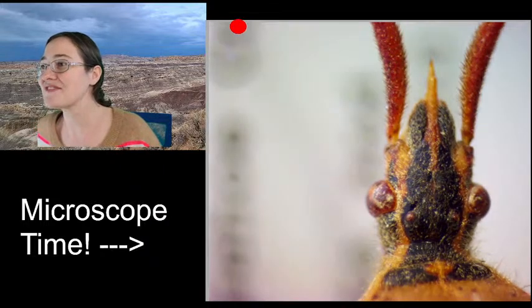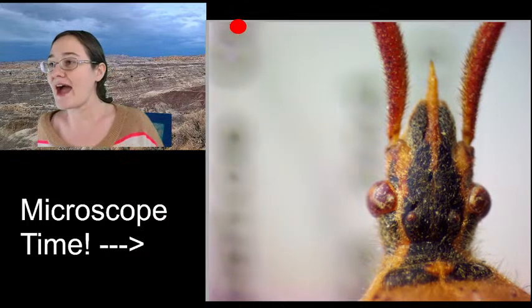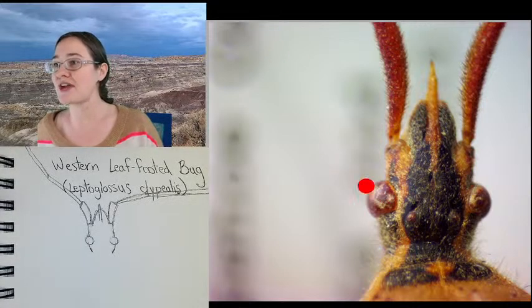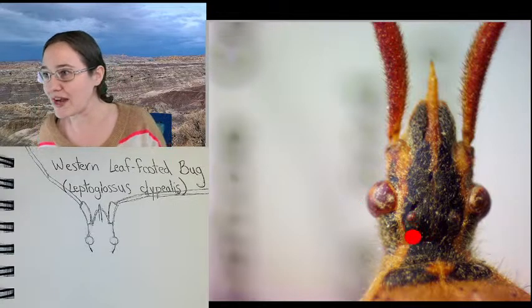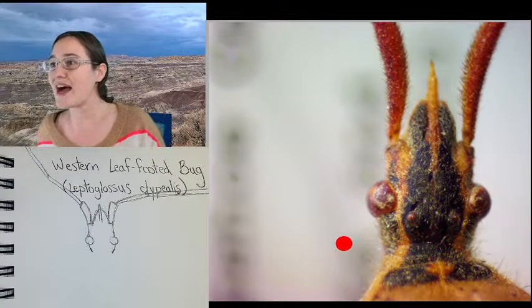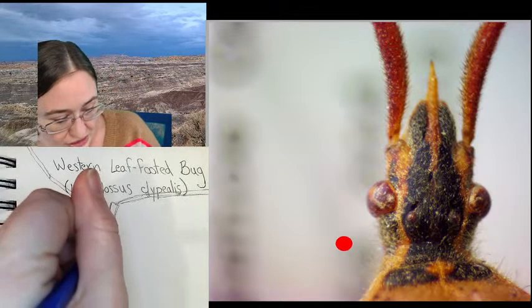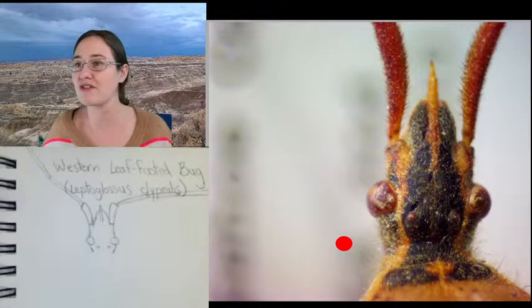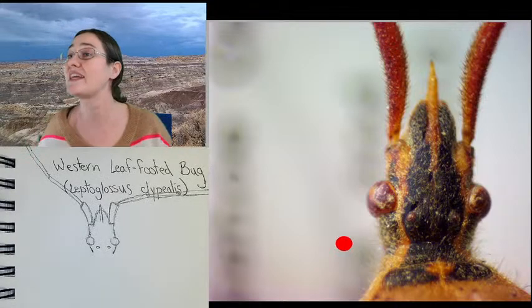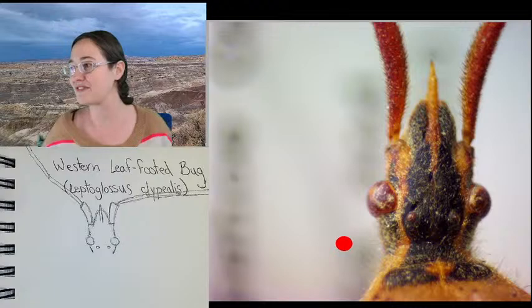All right, so we've got a variety of really awesome characters here to check out. He has these really awesome compound eyes here, right? And then if we look really, really closely, right about here and there, our specimen does have two little ocelli, or little itty-bitty simple eyes. These are those light sensing eyes that can't really see shapes and colors, but they can see light and dark. So they have the ability to kind of see shadows, see things flying overhead, watch out for predators, that type of stuff.